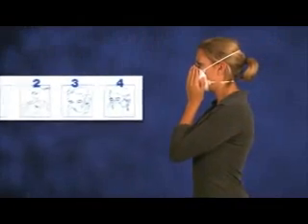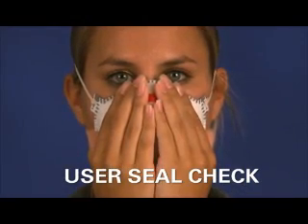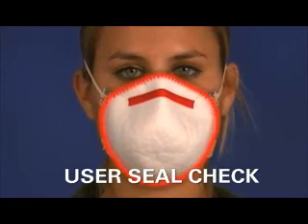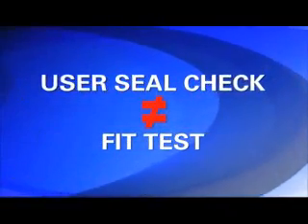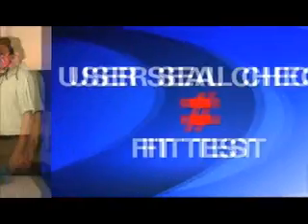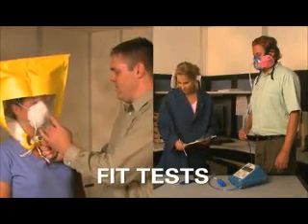The manufacturer also supplies instructions on how to properly conduct a user seal check. A user seal check is a way to verify that the respirator has been properly positioned on your face to assure a proper seal. Sometimes workers confuse the term user seal check with the term fit test, which is different. A user seal check is not a substitute for a fit test, which is a more involved process that uses a test agent or instrument to verify the respirator's fit.